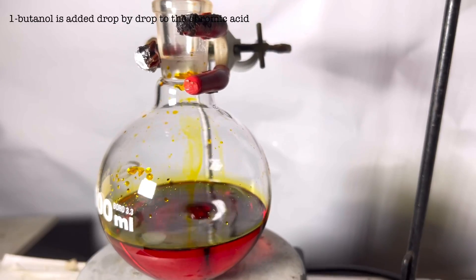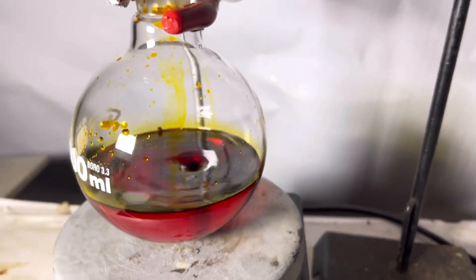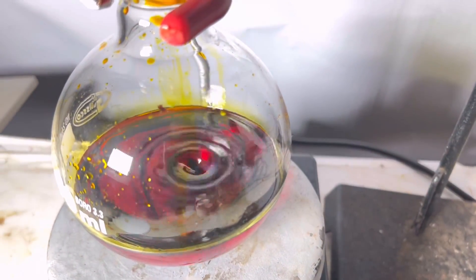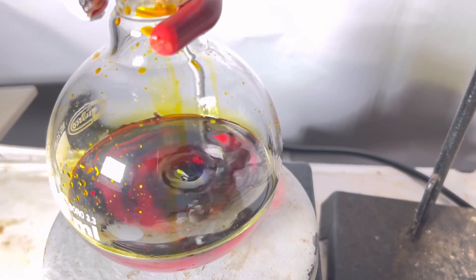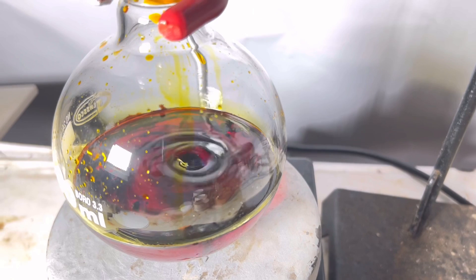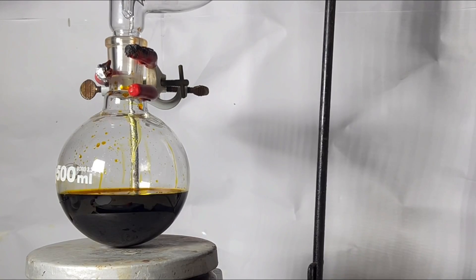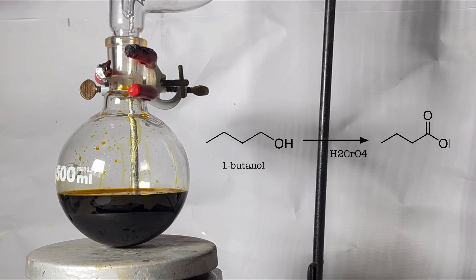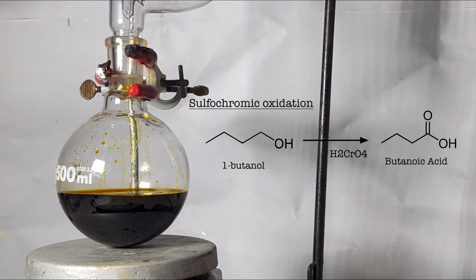Immediately upon contact with the chromic acid the solution starts to darken as the oxidation has begun. Here, one butanol is oxidized by the chromic acid to butanoic acid or butyric acid thereby the hexavalent chromium is reduced to its trivalent state, indicated by the change in color from orange to dark green. This method of oxidation is also known as sulfur chromic oxidation method.